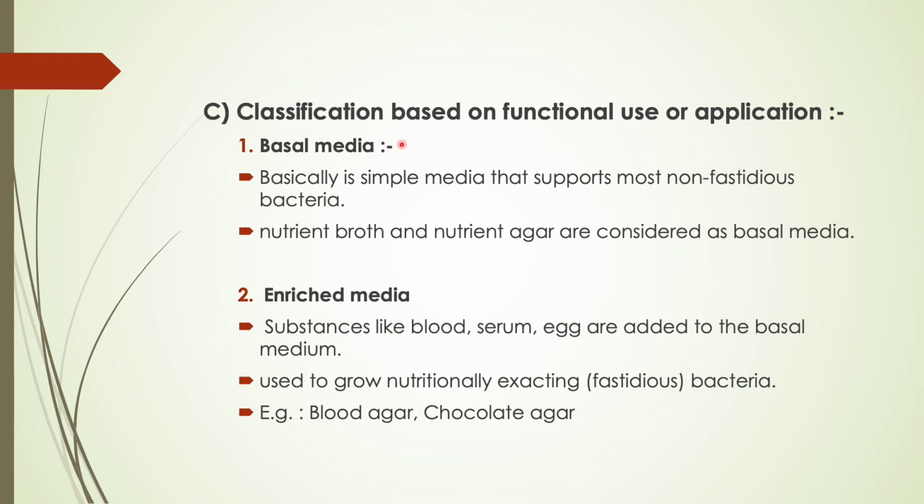For example, basal media is for non-fastidious bacteria. So you have a common bacteria that can grow in any culture media.